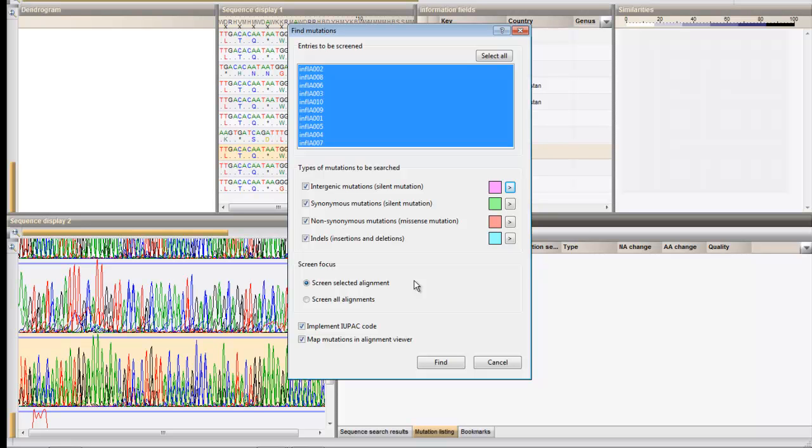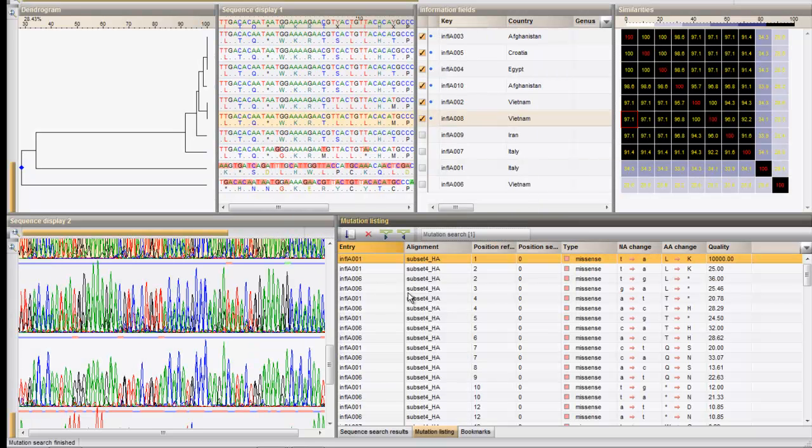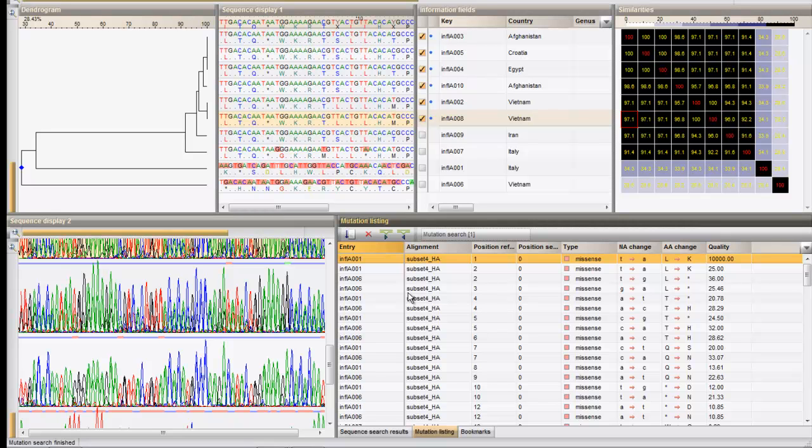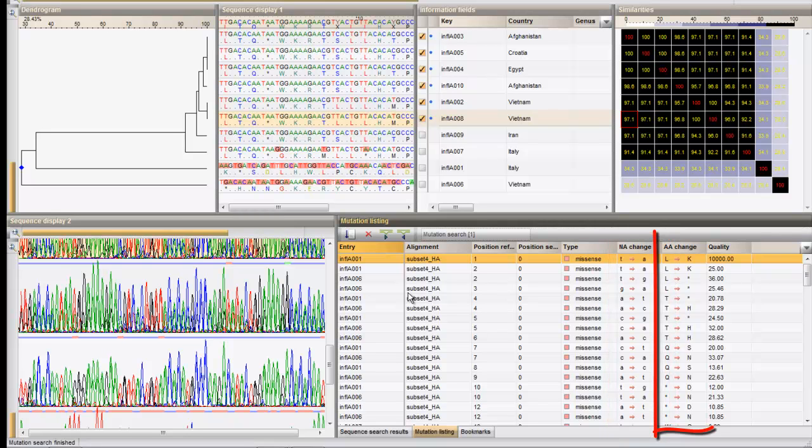Press find to start the mutation search. The resulting grid lists all mutations found in the comparison with the consensus. NA change is the nucleotide change and AA change is the change in amino acid, if any.